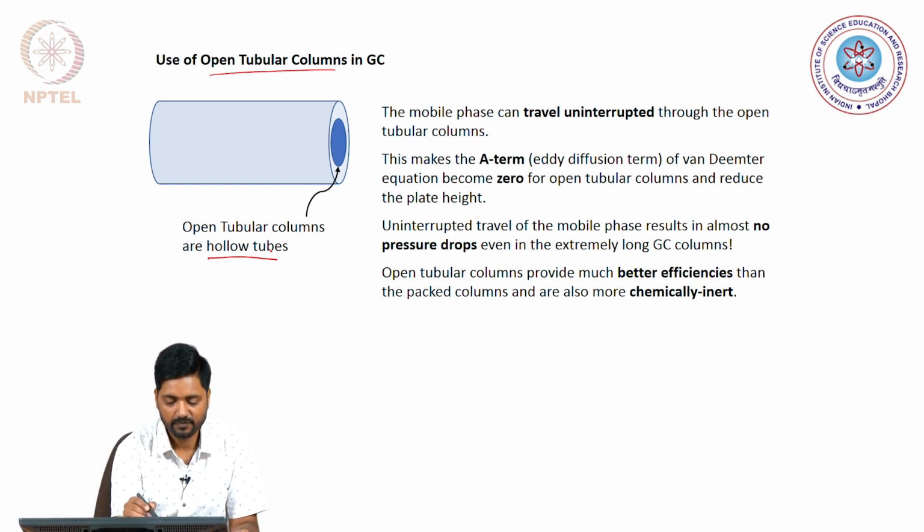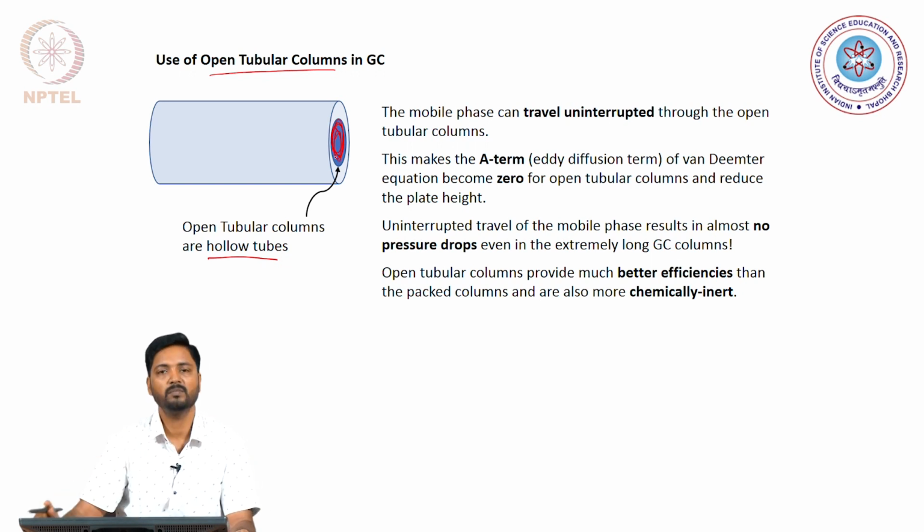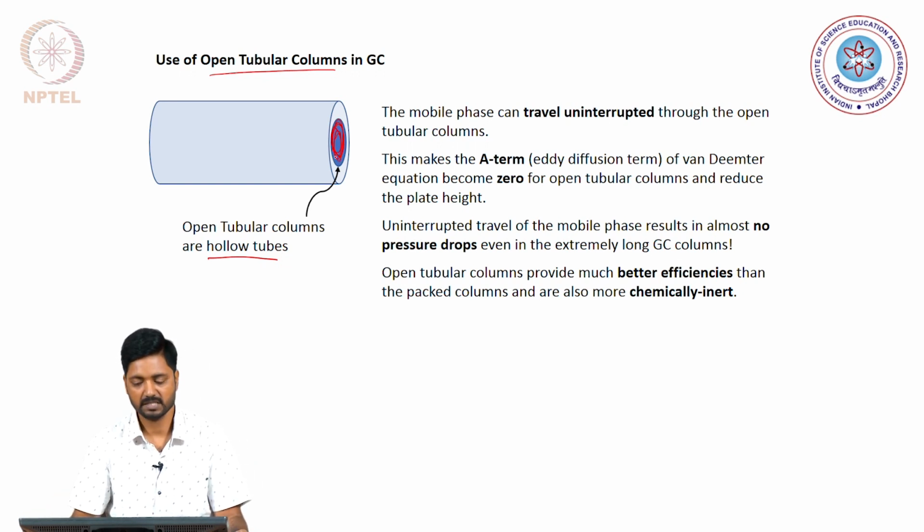So, we have a hollow structure inside this column through which the carrier gas can travel uninterrupted.